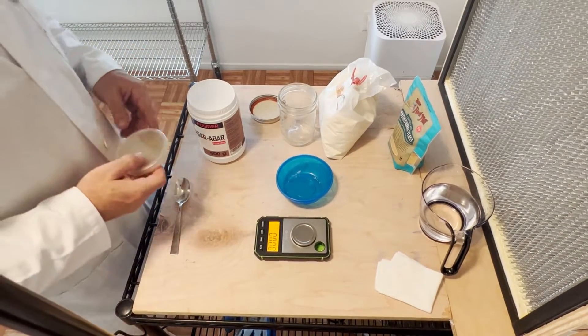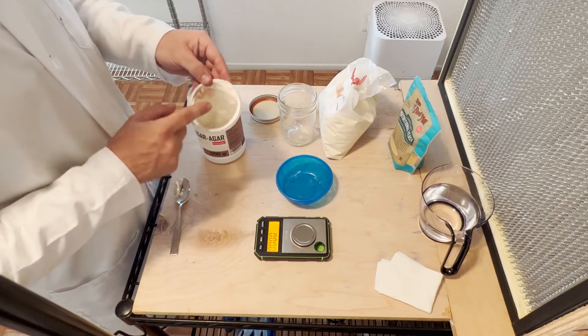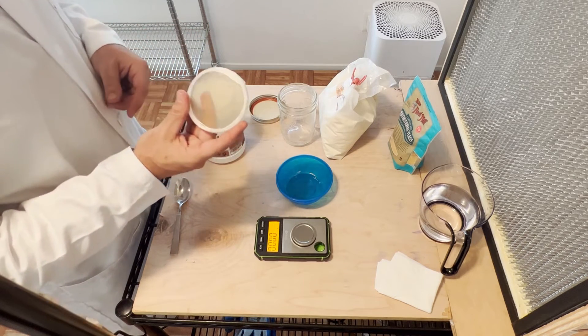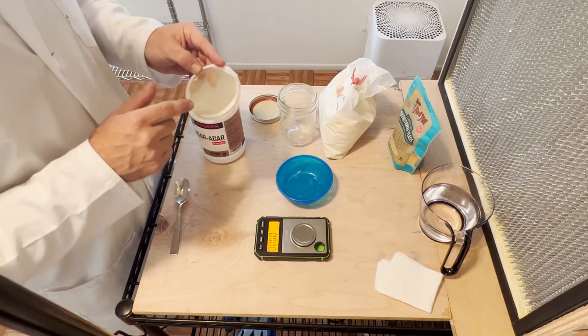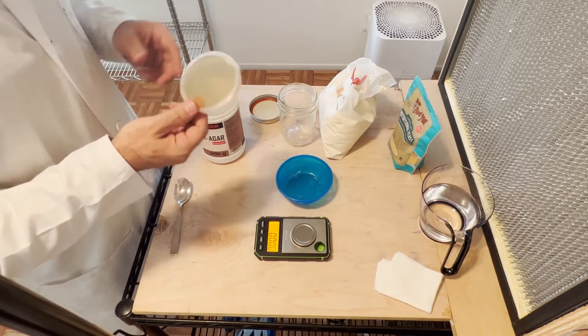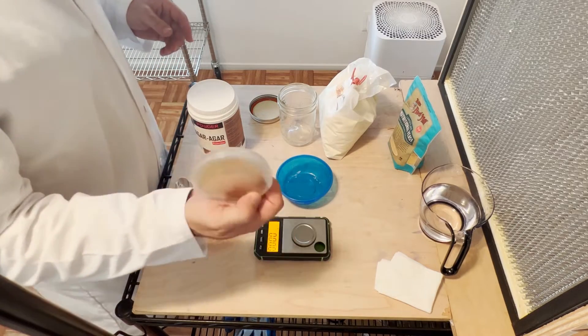This is the process for making agar. Agar is a solidifier that has nutrients on a plate for the mycelium. When we do spores or liquid culture and we want to grow them out, we want to make sure there's no bacteria — we're going to grow them out on this substance called agar.